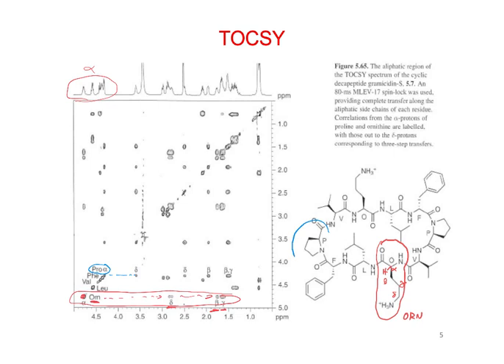So here's a proline right here. Along this line, here's the alpha, so that would be right there.